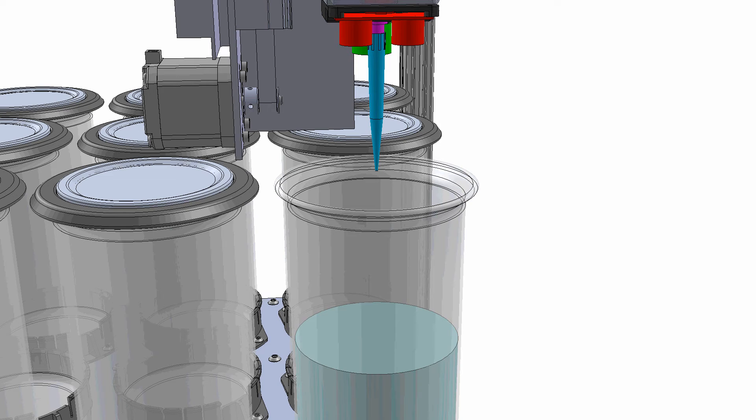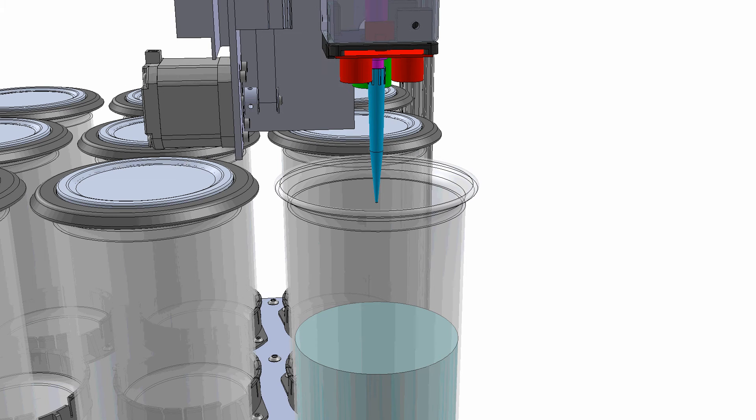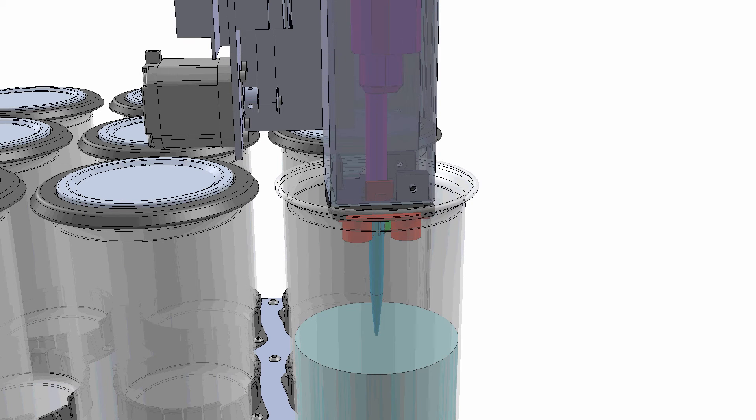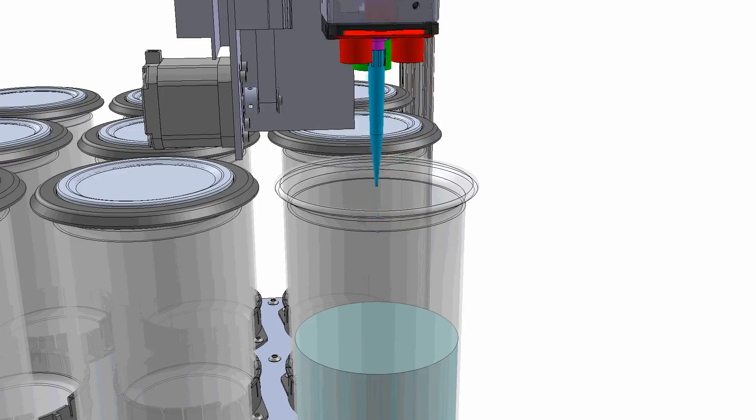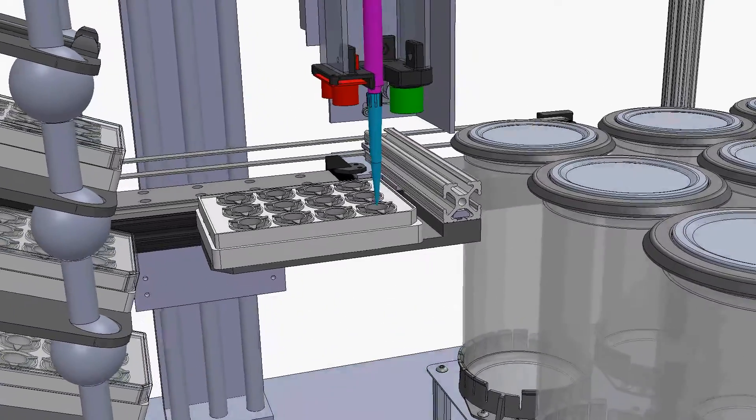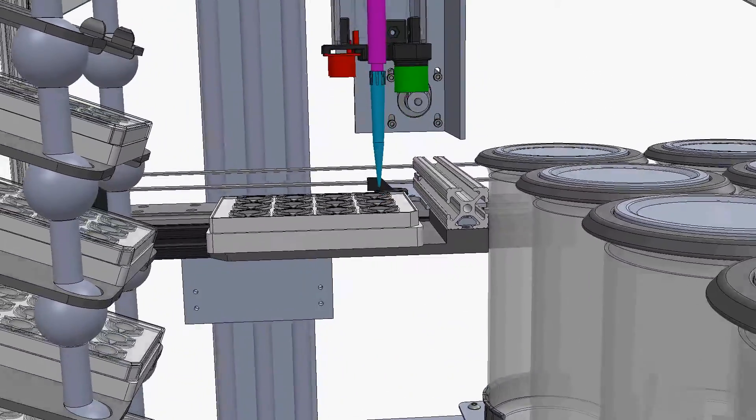The pipette is positioned over the beaker. The red ultrasonic sensor measures the fluid level to 1mm accuracy. The pipette tip is positioned just below the bacterial suspension surface. The pipette is moved over the appropriate well and the bacterial suspension is dispensed.